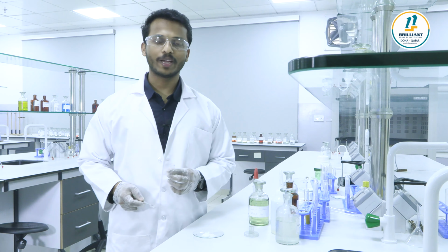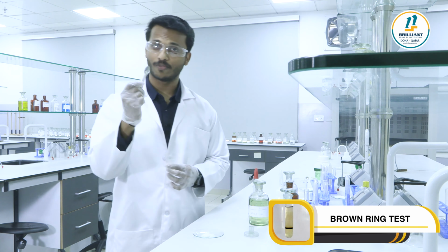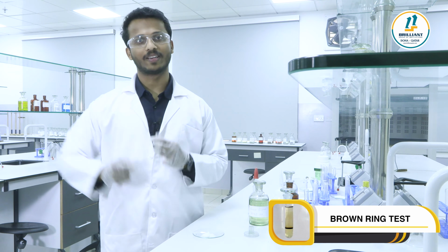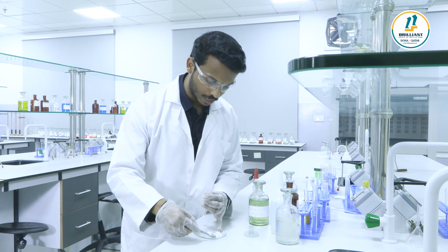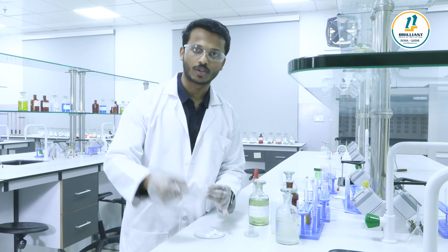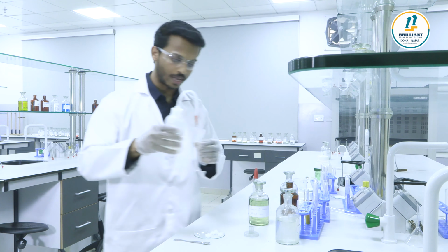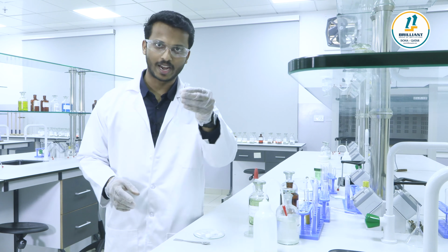Let's go to the confirmatory test for nitrate ion. Dear all, the confirmatory test for nitrate ion is called the brown ring test. It is a little difficult to get, but easy. Don't shake the test tube while you're adding the reagents. Let me take a pinch of salt into the test tube and make it a solution. You can add a few drops of water.